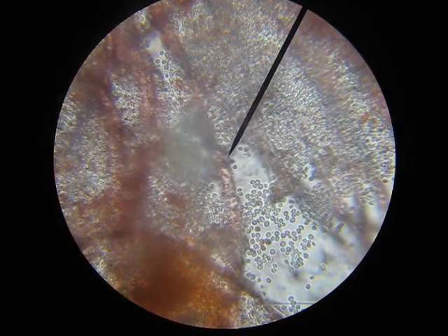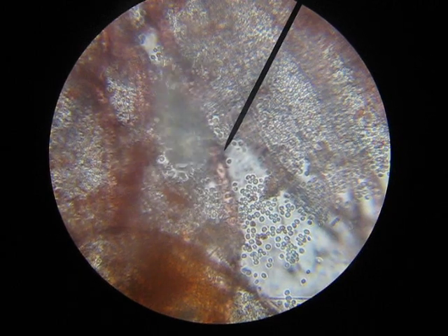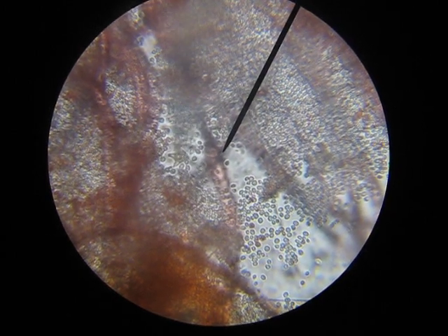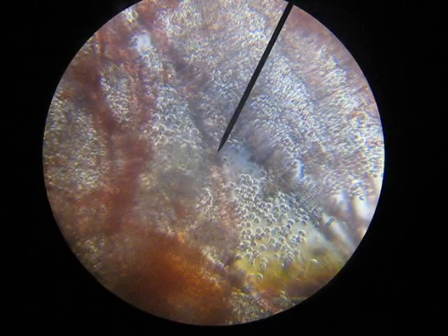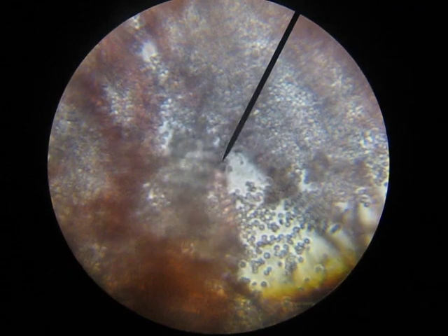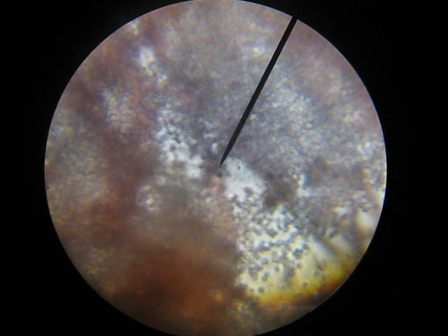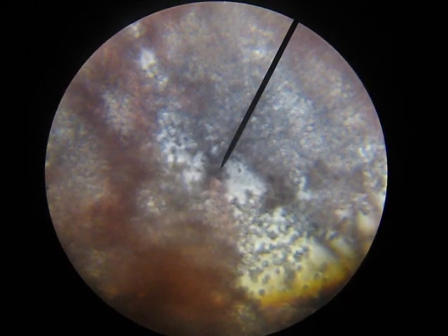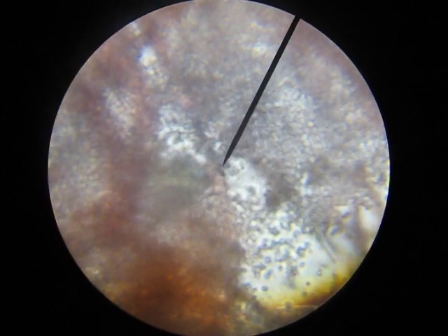You could clearly see it eating. Can you adjust the fine focus while I'm taking this video to see if you can see it? Maybe go the other way. I barely even turned it. Right there. It was clearly eating or eliminating waste two minutes ago. Let's see if it'll do it. I don't know if that's clear enough that they'd be able to see it.